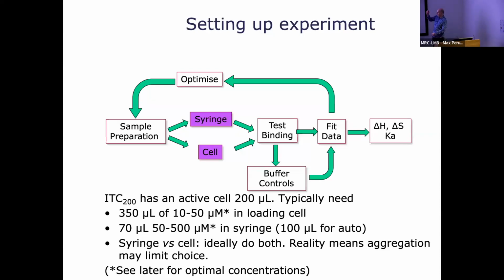So okay, you've got a cell and you've got a syringe. Which one do you go? Which one do you inject into what? Do it both ways if you can. But the choice may be limited because you can't get one of your components up to the right concentration.